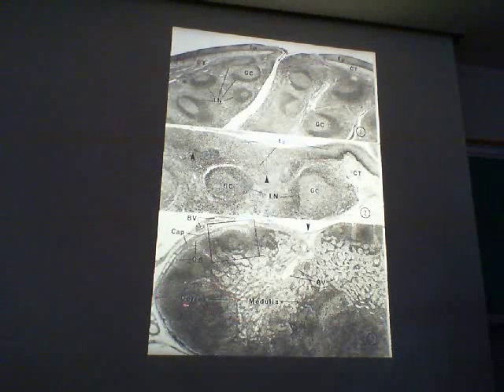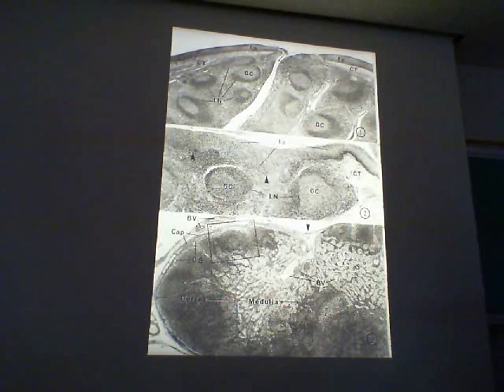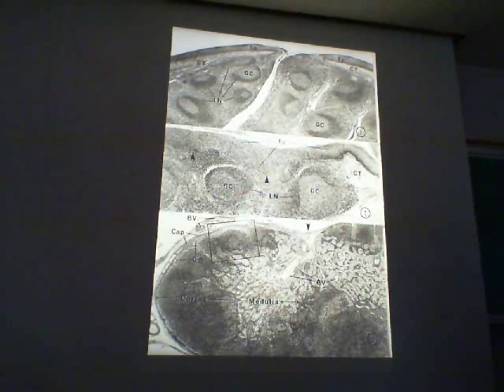Okay, what is this right here? Cortex. Cortex, and that is the medulla. And then we have the capsule. And how about this organ? Have it up here, have it right there. What is this organ? Palatine tonsil. Okay, you see the stratified squamous epithelium. That structure right there is what? Crypt. Okay, there's a crypt.